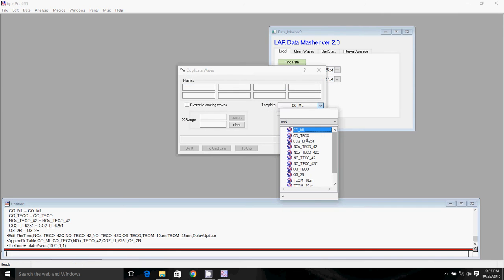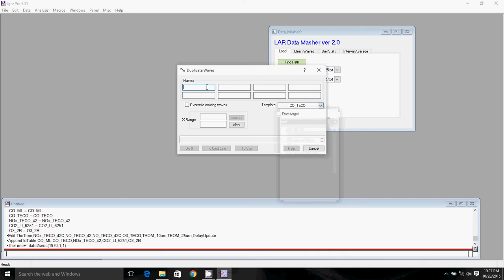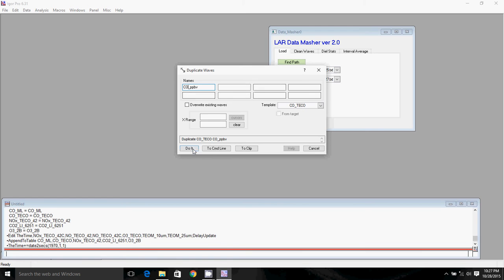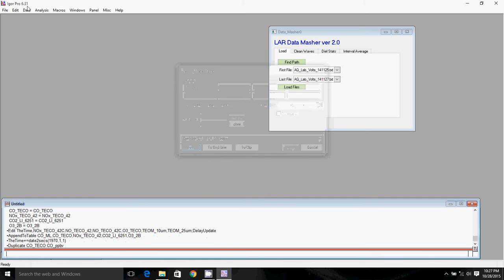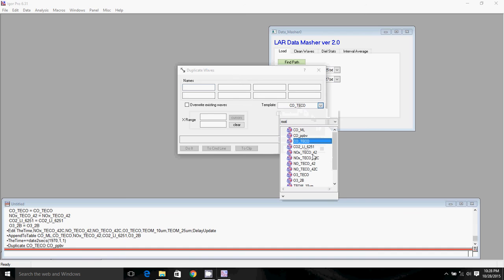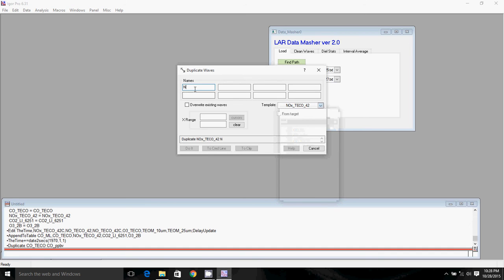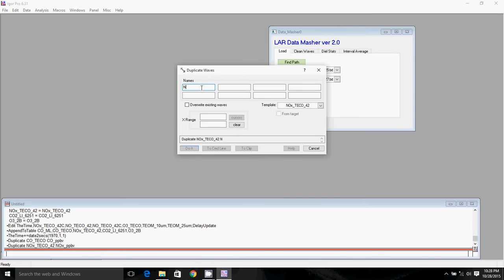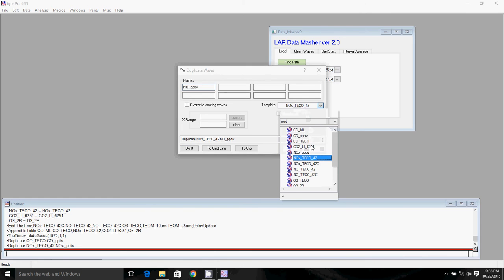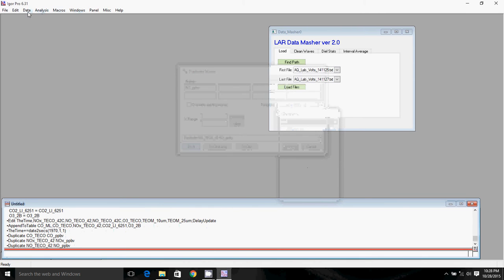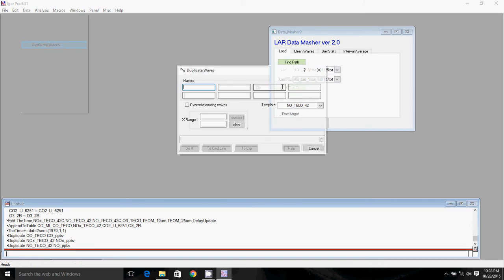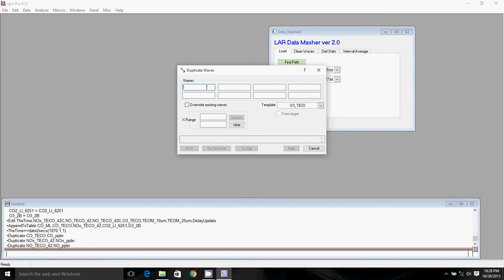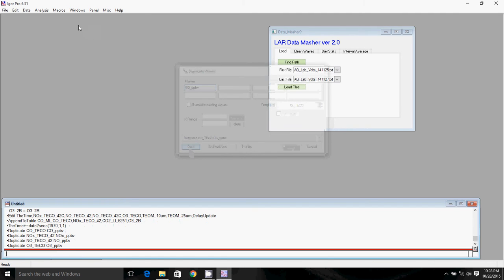We're going to select the waves we want to duplicate. So first we'll do CO. I'm going to call it CO PPB because I'm going to convert it into PPB. When you guys are doing this, you might want to add, for example, put in the name of the instrument, because you're probably going to have two instruments worth of data for your comparisons, but I'm not going to do that for this example because I want to keep things as simple as I can. So I've got CO duplicated. I will go ahead and duplicate the NOx wave, duplicate the NO wave, and I will duplicate the Ozone wave.